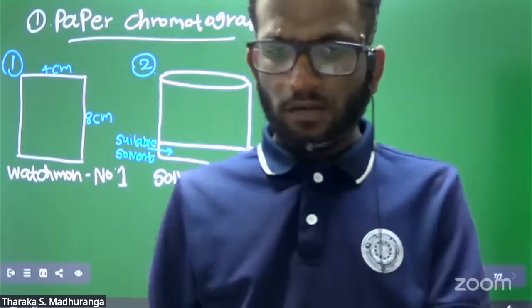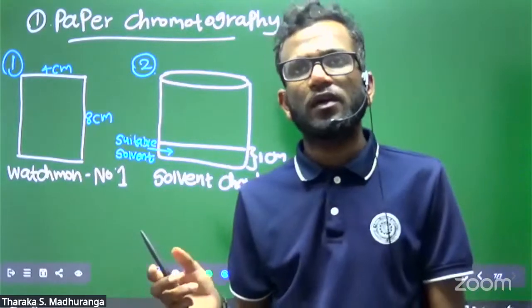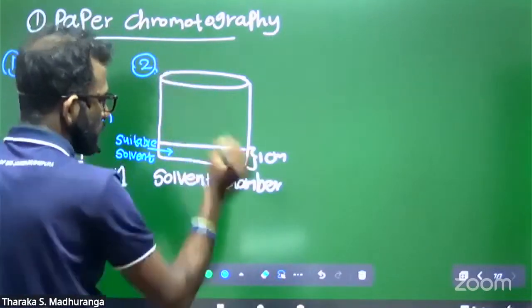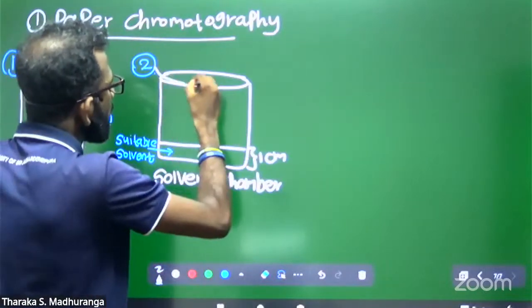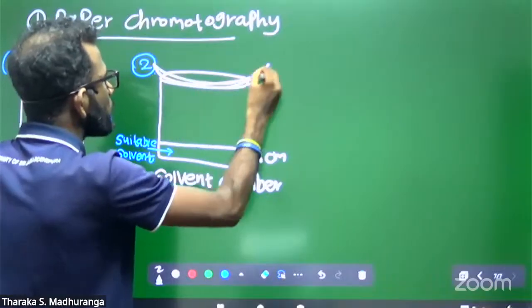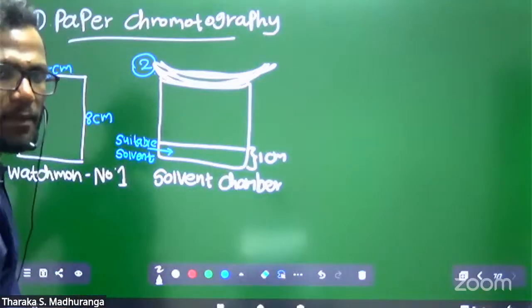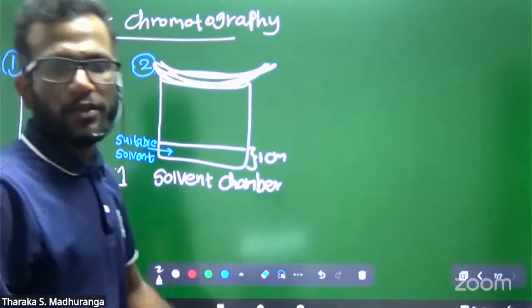Whatever glass you can use to close this chamber, close it for 20 minutes.